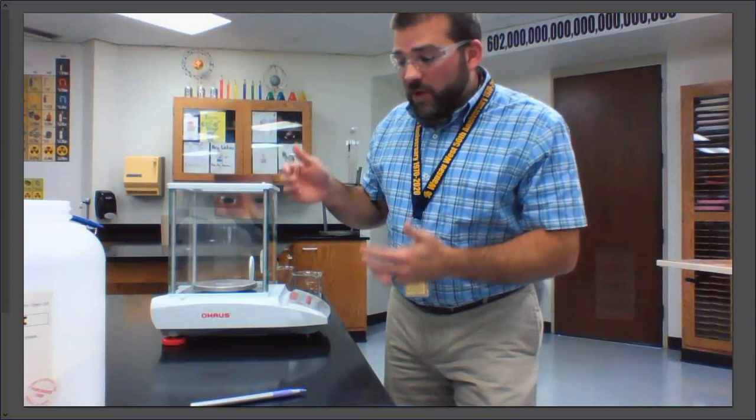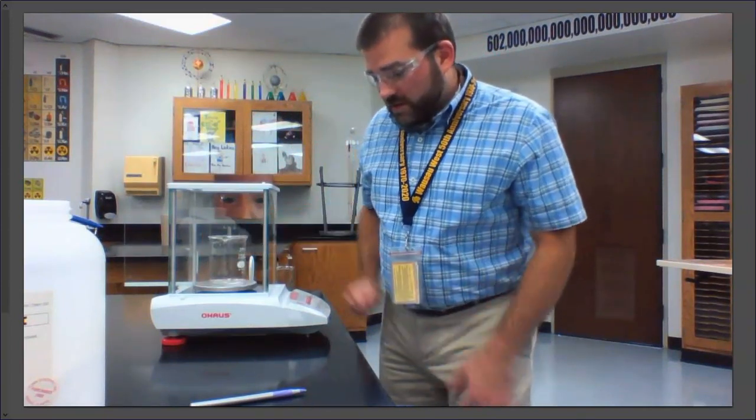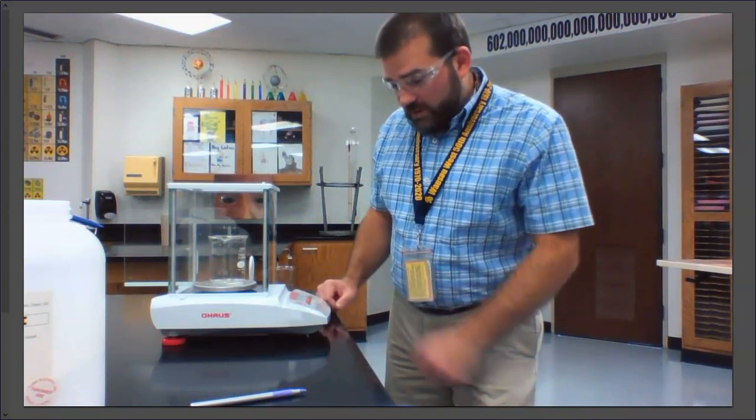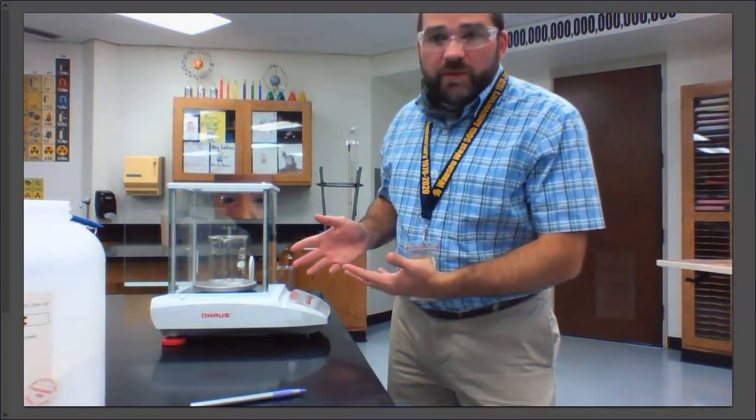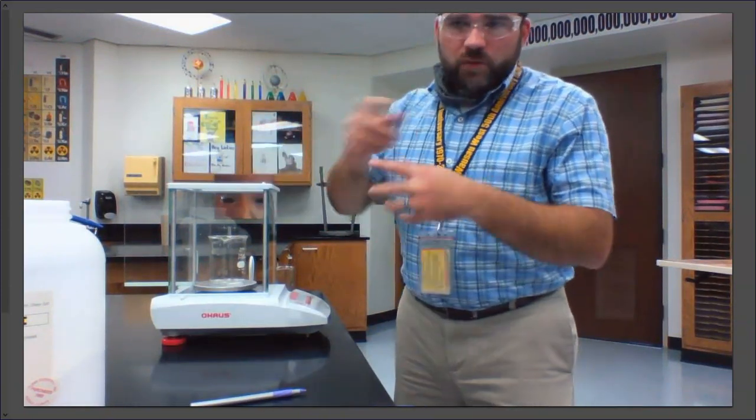So I'm going to be using this balance, and I'm going to be massing my sodium carbonate directly into my beaker. I put my beaker on the balance, and then I hit the tare button, which brings it to 0. That's appropriate technique. I don't care how much the beaker weighs. I could record that mass, add my chemical, and then subtract the mass of the beaker, but that's just a waste of time.